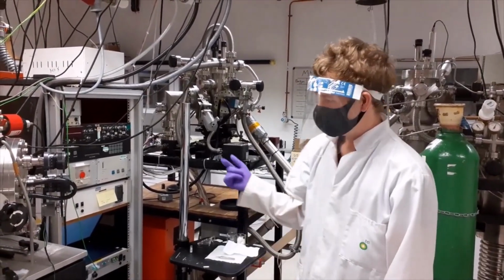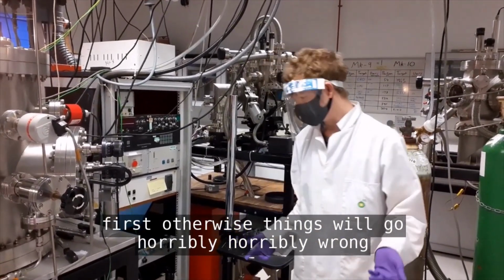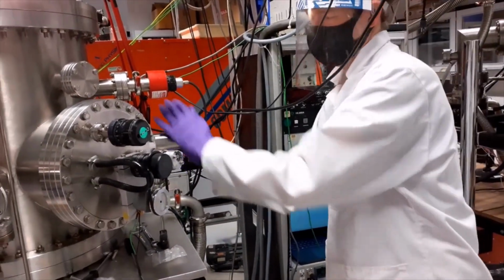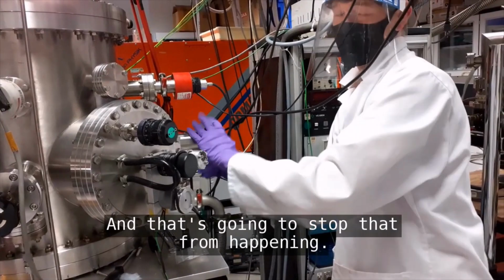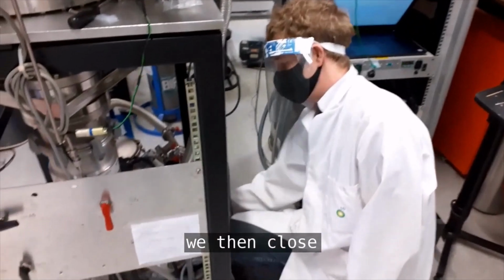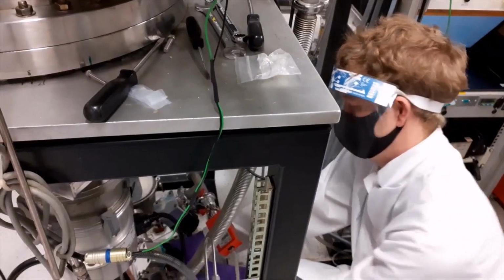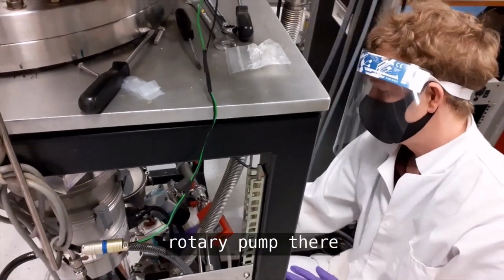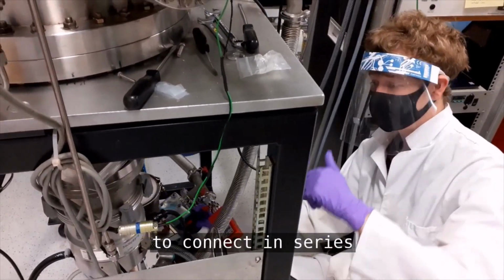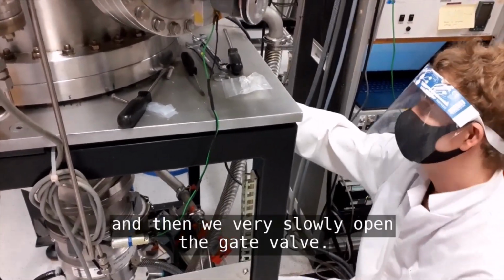Now to do that, we have to do a couple of things first, otherwise things will go horribly, horribly wrong. First thing we need to do is close this valve here, and that's going to stop that from happening. So that's nice and tight. We then close this valve, again connecting the chamber to the rotary pump there. We open this one, which allows the turbo pump to connect in series to this pump here, and then we very slowly open the gate valve.